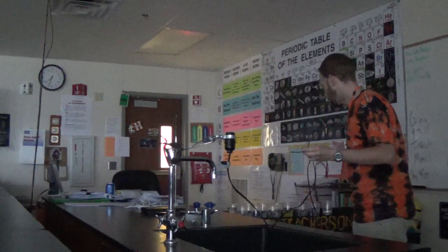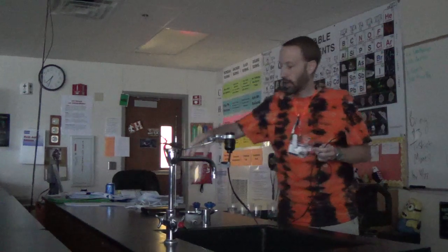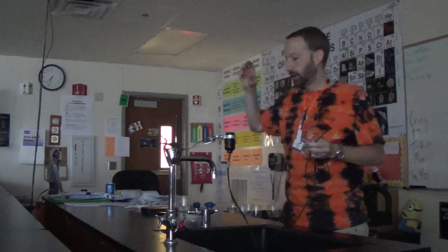Now first up on your list is? Distilled water. Distilled water. Okay. So I showed you yesterday how Bill Murray's character sat in the bathtub, dropped in the toaster, and you're led to believe he killed himself with electrocution. And I said if my bathtub was full of water, I'd be perfectly fine. My toast would simply be soggy. I'm about to prove it to you.